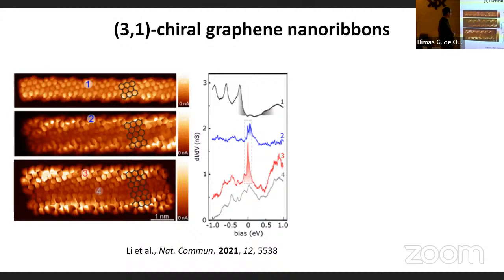If you go to these wider ribbons, you see that you have a very strong intensity just at the Fermi level, which refers to this high intensity that we had. These are the states that undergo spin polarization and have this radical character. The same happens for this intermediate ribbon width.